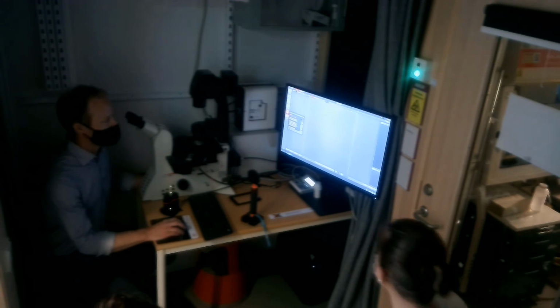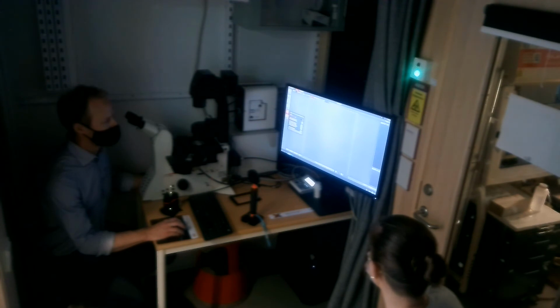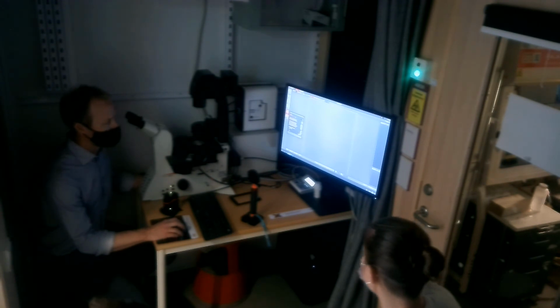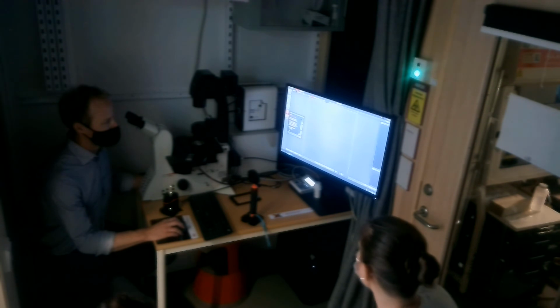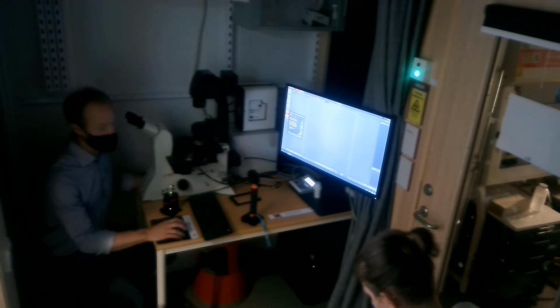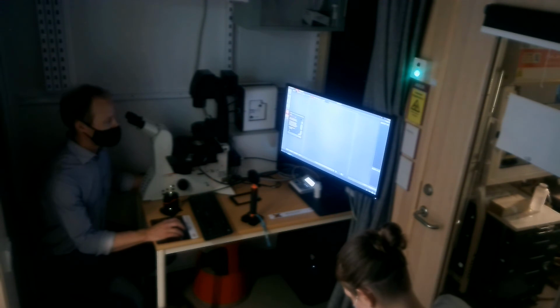And then you have a few different options. They sort of describe themselves what they are. If you want, you can click on this to go and read more about them. I will not talk about them individually now, but the last one, merge images during acquisition. So if you want that, you can activate that. So I will activate it. You get a few more options. You get the option if you want to keep raw data. That's always on per default. We recommend, if there are no special reasons for deleting it, I would suggest to keep it. But you can also delete it.